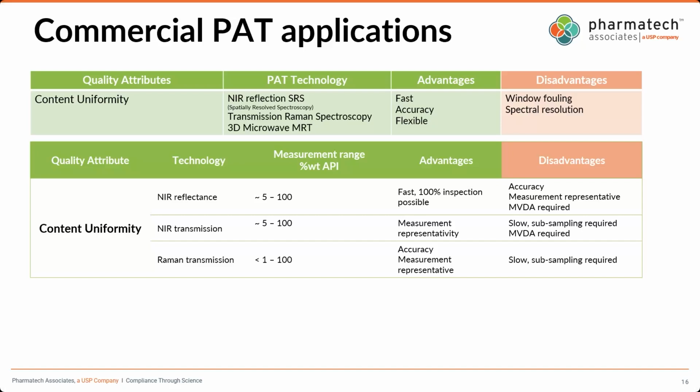Yeah. So if you have a high volume production, it makes sense to go with the PAT technology that facilitates the faster analysis. But I would say for Raman, this is where you have to know about your product, right? There are certain products where you know that they have a variable. You need highly sensitive analytical technologies because it could be a narrow therapeutic index sample, where you need a high sensitivity to analyze whether you have the right amount, the right dosage of API, or you have a product with low API dosage. In that case, it's justifiable.